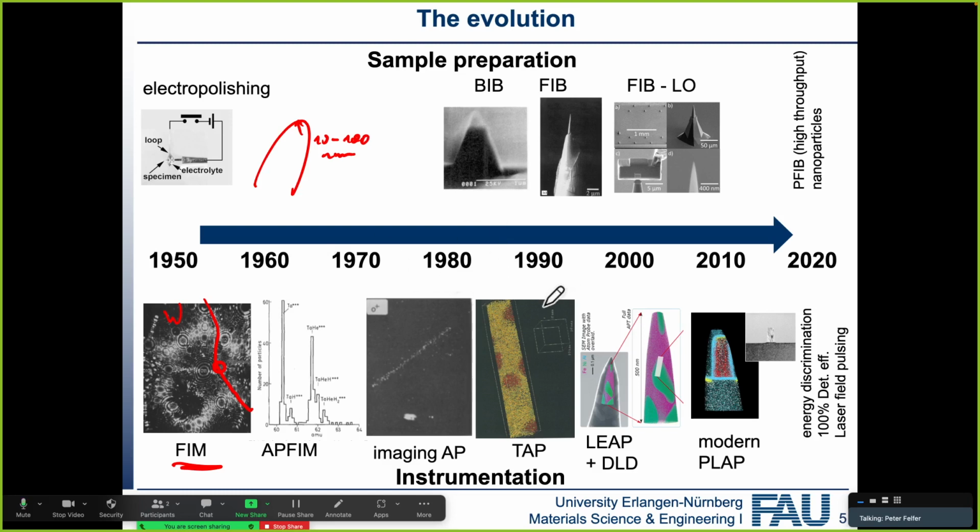This is a setting. I could set it to detecting 1 ion in each pulse, or 10 ions in each pulse. But typically, as you'll hopefully know after we look at detector technology, we use 1 every 100 pulses, as we can really make sure that we isolate them and really find out which atom is which.